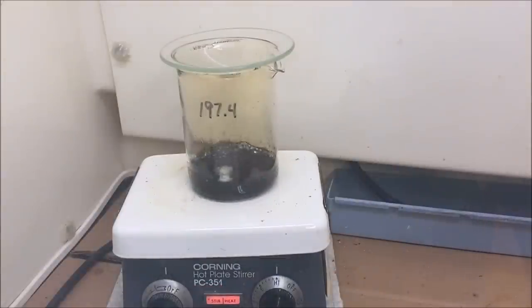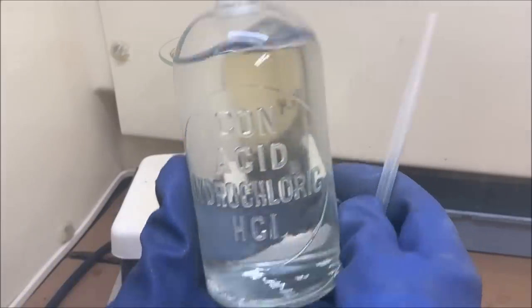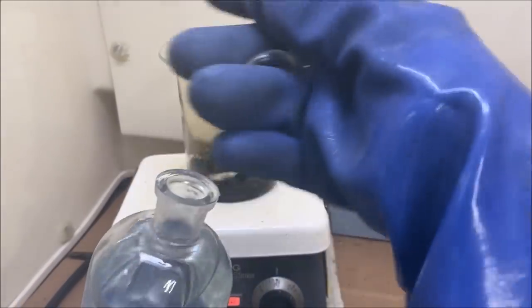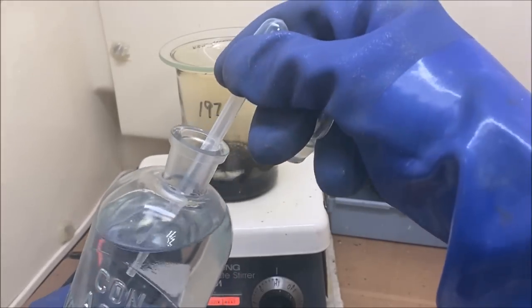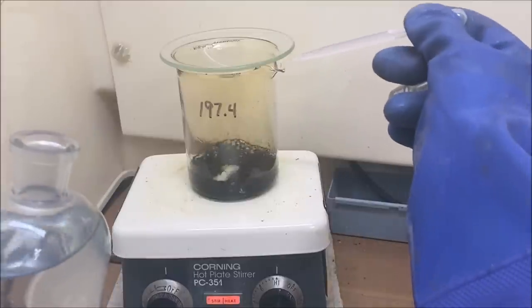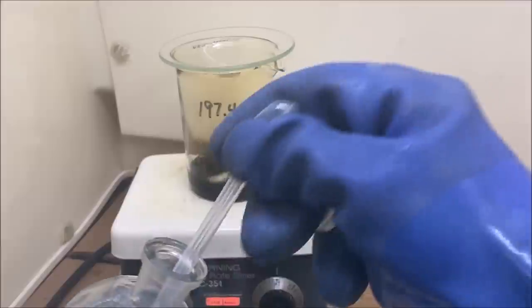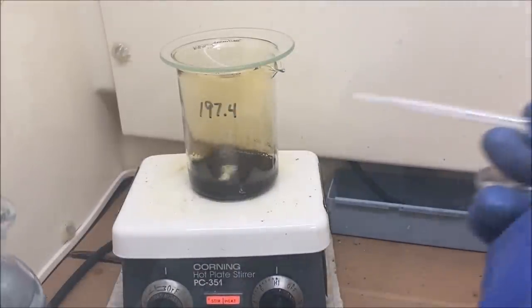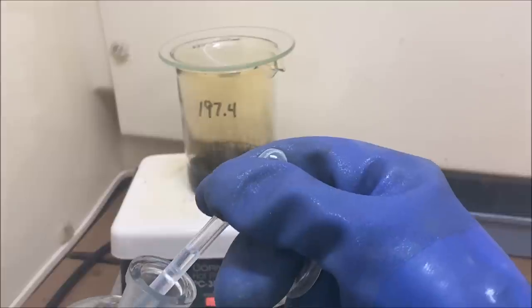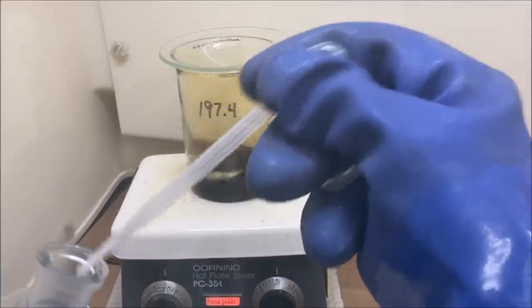Here you can see I've got it evaporated down, and I began to get a little concerned because it looked just like that in the previous evaporation when I took it down to almost dryness. I can still see some brown fumes in the beaker. So I didn't want to take a chance. I'm going to go ahead and hydrate it with some hydrochloric acid. And you'll see there's still some brown fumes being driven off as I add the hydrochloric acid.